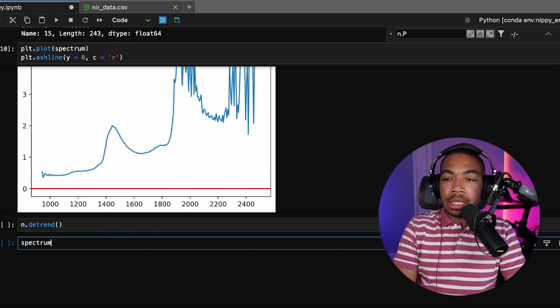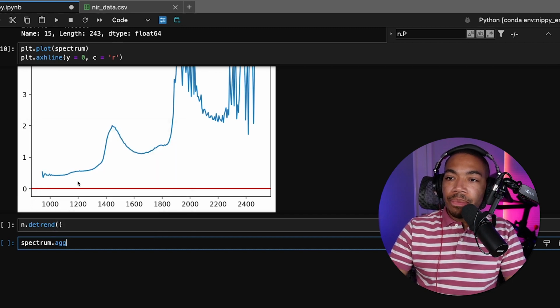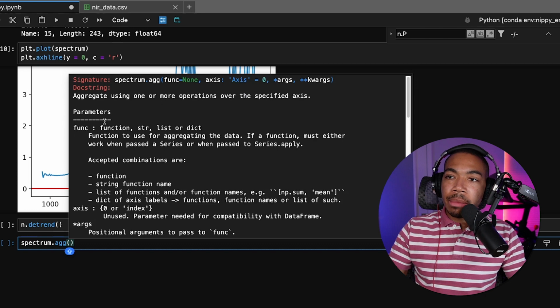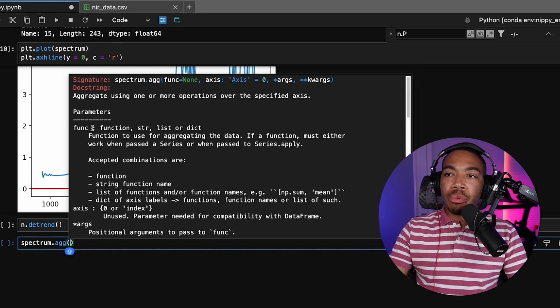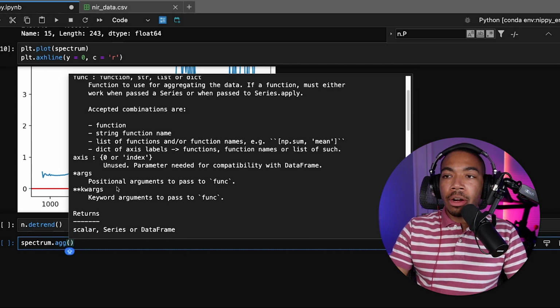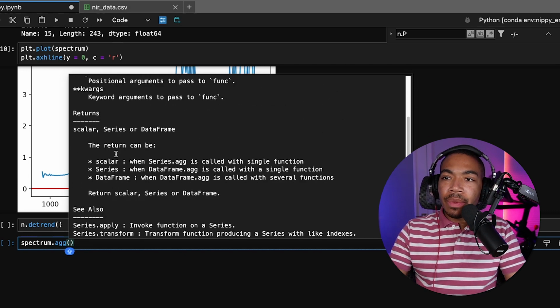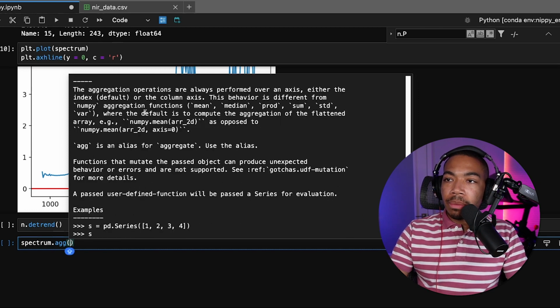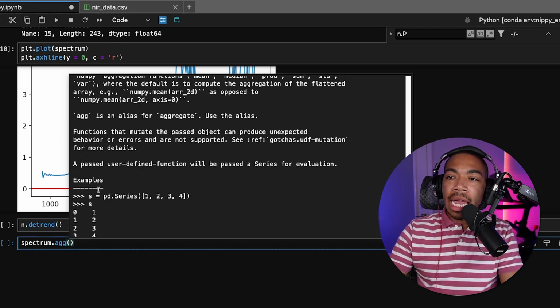Let's just get a series method, and let's just choose one randomly, agg. Here is a professionally documented function. You can see we have the parameters, some function, we have our arguments. There aren't many in this case, but it also tells us what the return variables are, other ways to use it, some notes on the activity, and examples.